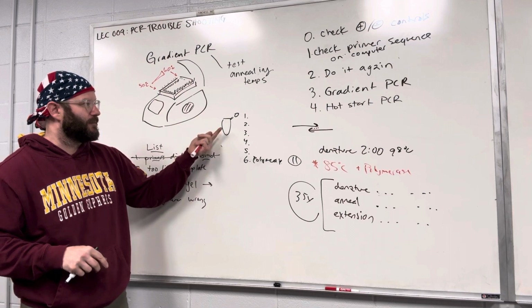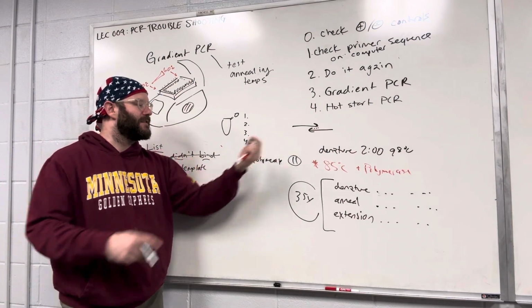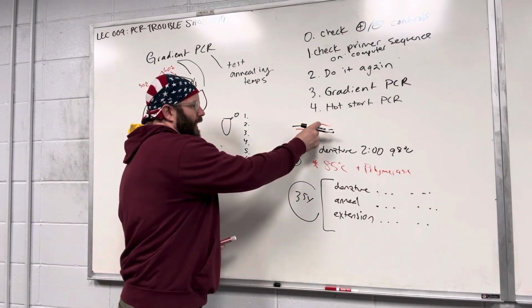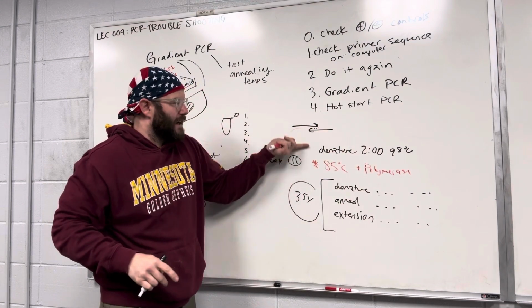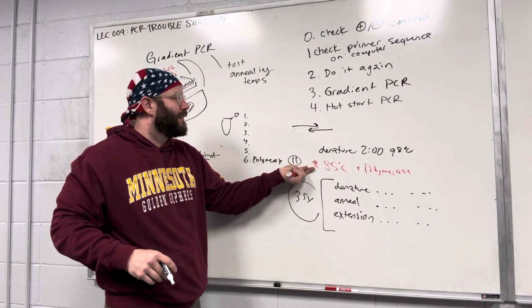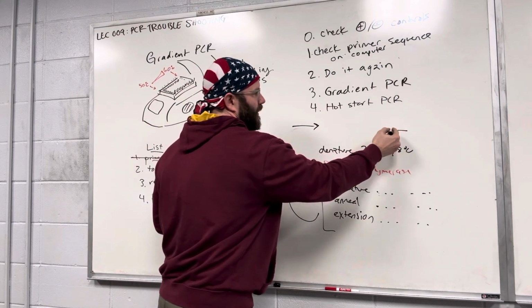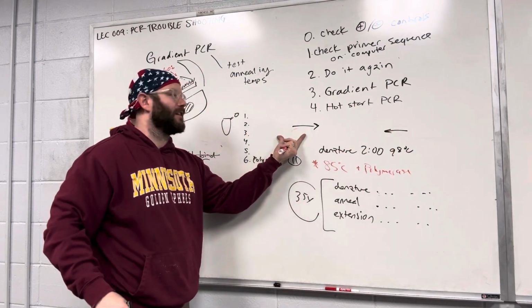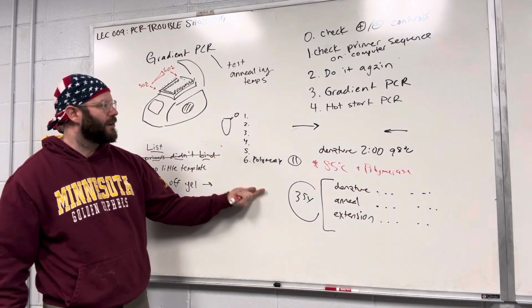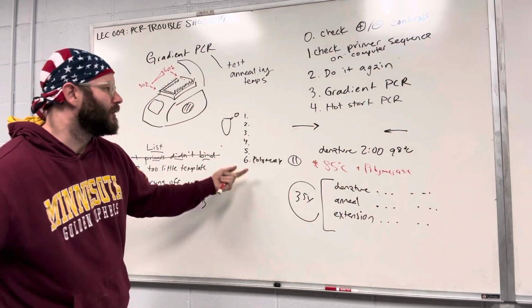Yeah, so if you mix up the tube when it's cold, or at room temperature, and you add the polymerase, then the polymerase can just write those primer dimers right away. If you don't add the polymerase until the reaction is hot, which is why it's called a hot start, what's gonna happen to the primer dimers when it's hot? They'll separate. They will separate, okay? So they'll be separate. And then you add your polymerase, so it's not writing that. And then you enter the loop, and it will usually succeed, okay? So a hot start fixes one problem, which is the primer dimers, usually.